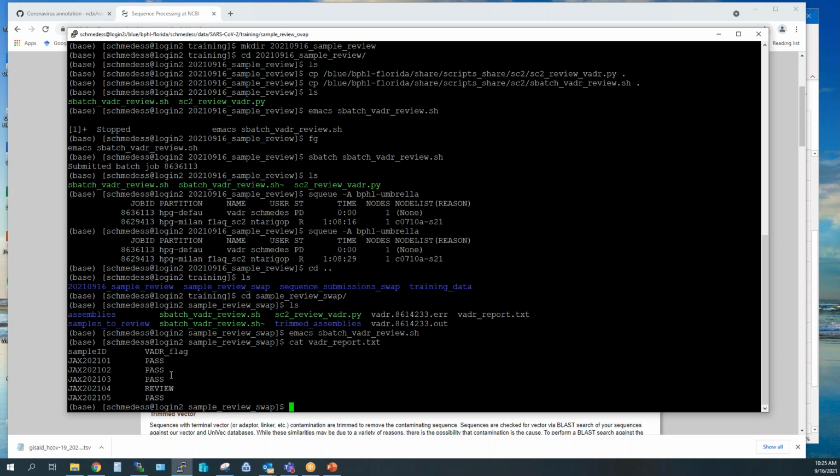it's recommended that you batch your samples and submit them on at least a weekly basis to get them up into the databases as soon as possible, because it takes longer. Anything that's a flag sample requires manual review, and it takes up a significant amount of time. And for most labs, there's no way to keep up with those. There's always going to be a backlog.